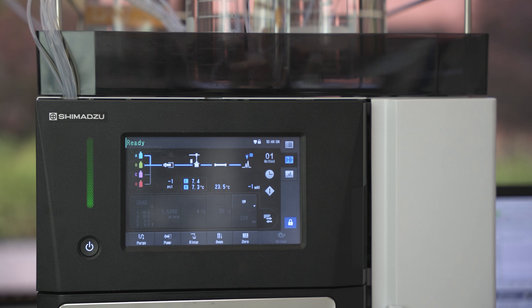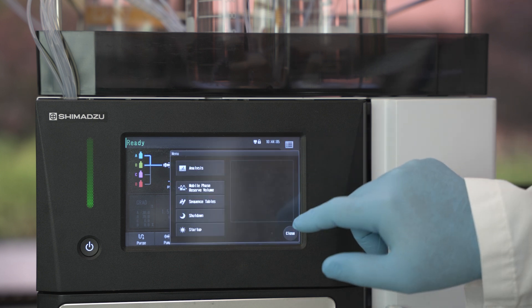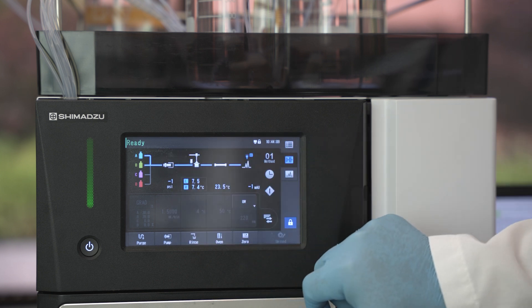To return to the analysis window, press the button in the top right corner of the touchscreen. Then press the analysis button.